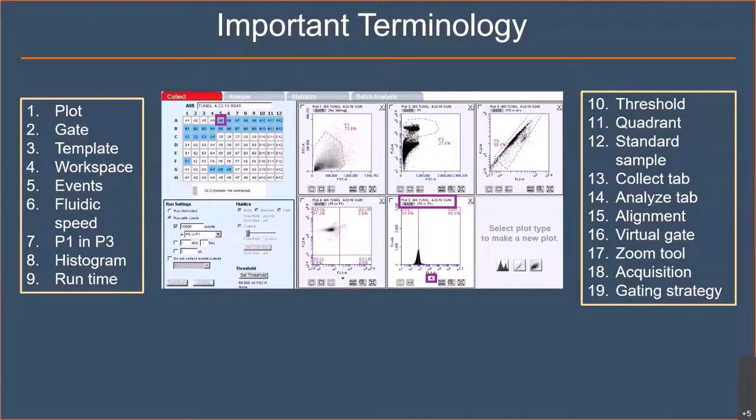We also have the last plots showing the quadrant, and these are the 4 quadrants, the lower quadrants and the upper quadrants, and the extent of DNA damage is indicated by the upper right quadrant.